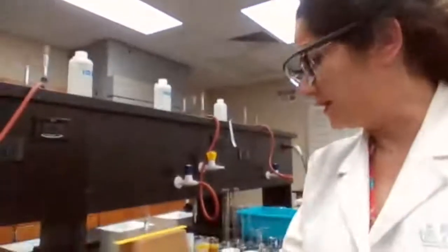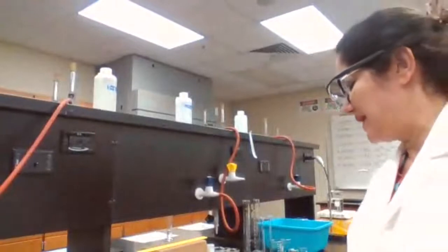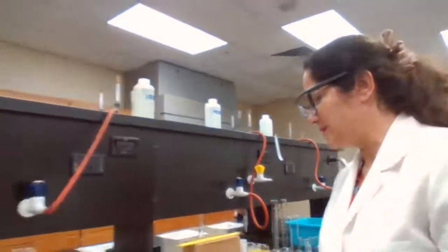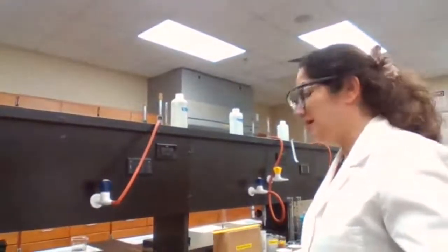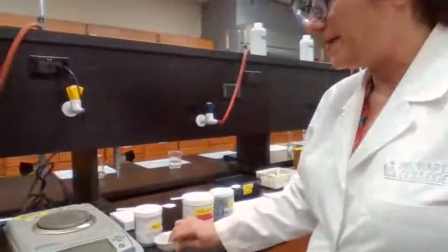At this point, you are done with the pre-lab assignments. You have read the experiment and the theory for the experiment. So we're just starting with the procedure. The first part of the procedure asks you to measure mass directly. The first item we want to measure is the mass of a penny.